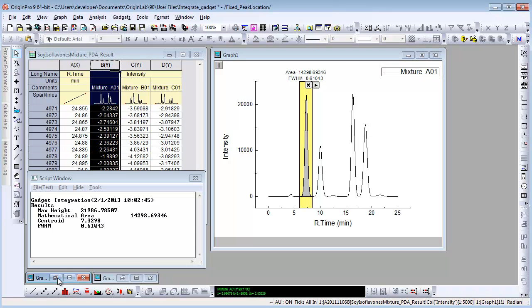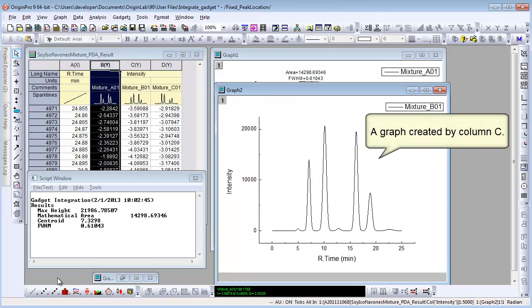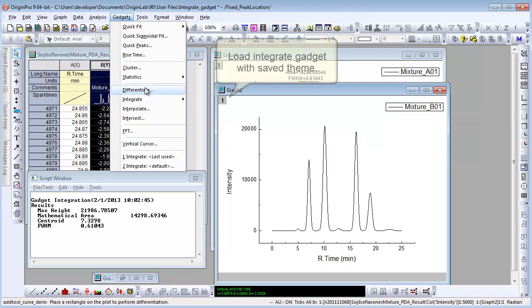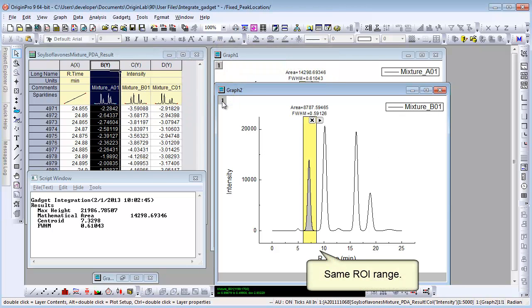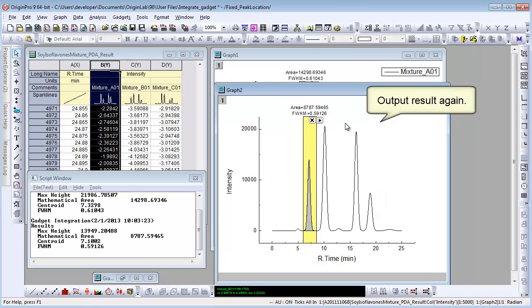Here is a graph plotted by another chromatography data in column C. Let's load Integrate Gadget again. The saved theme shows as a pop-up menu, so this time let's choose it. We can choose New Output directly to dump the area of the same region.